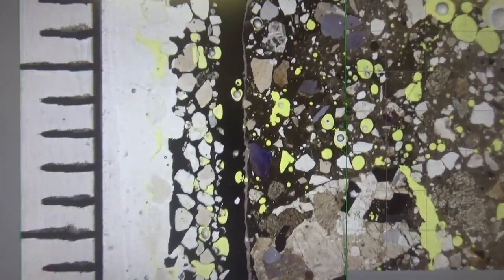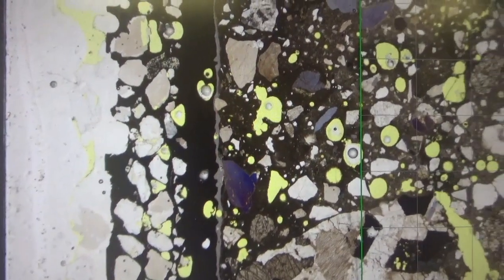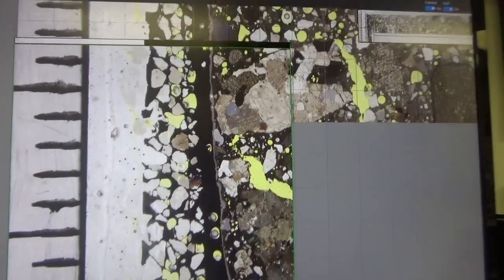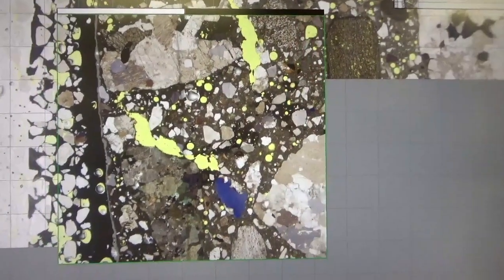This concrete sample has a urethane coating. You can see that dark urethane coating with quartz filler. Then you go to the third row, and again you keep 20% overlap, and then you go again from east to west.